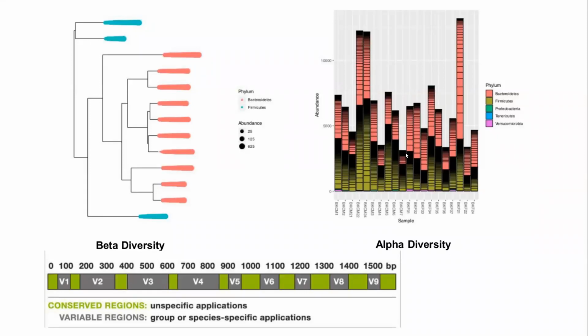If you remember the RNA-seq pipeline, we were trying to note in the table of expressions some quantifiable things, some RNA expression. Here, in that table, we basically tried to quantify the number of reads. Here, the entire thing is very different. We try to figure out the abundance. So the values of this sort of experiment are not in decimals. They are mostly whole numbers without any decimal part.